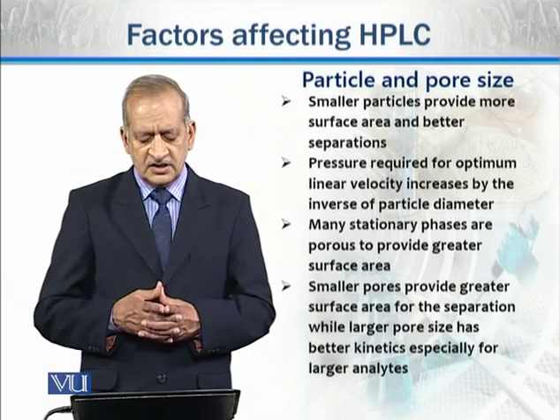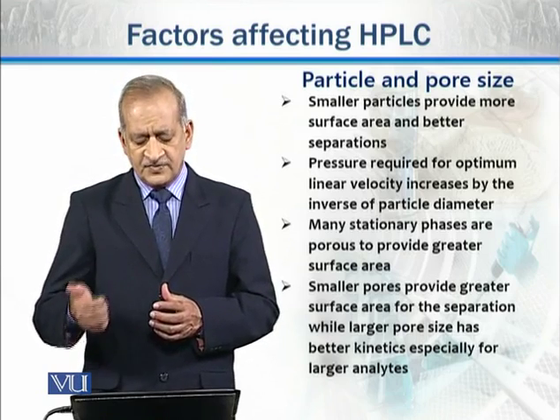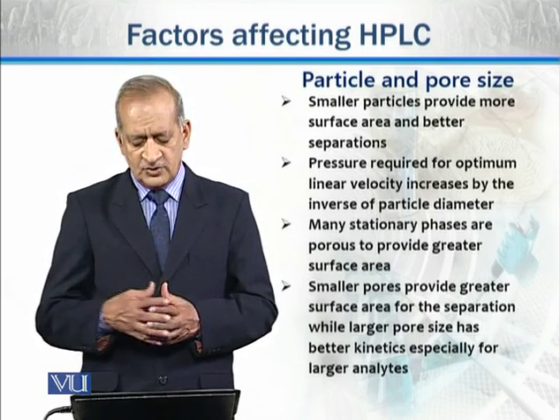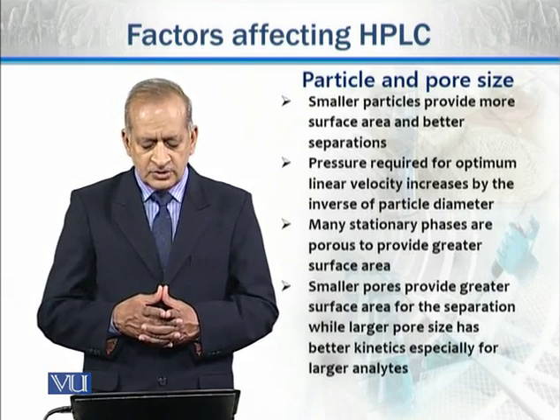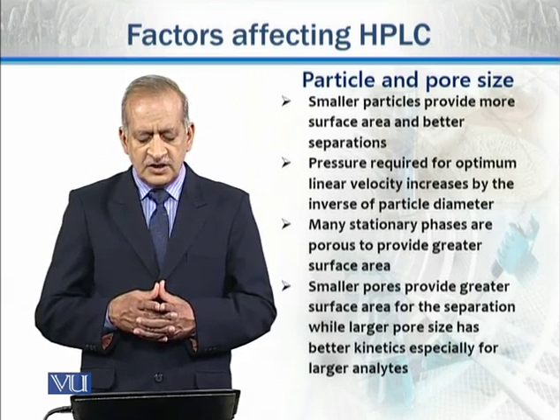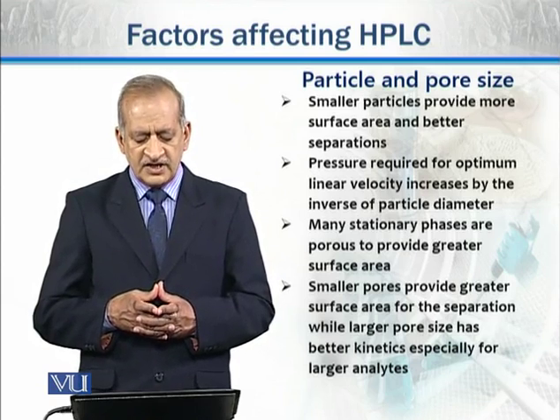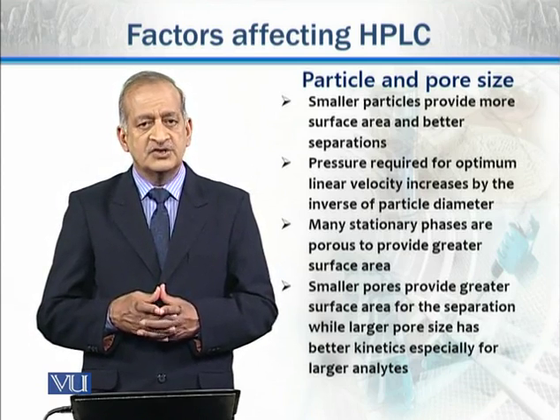जाहिर है अगर surface area ज़्यादा होगा तो उसके मुकाबले में हम कहेंगे separation जो है वो बेहतर तरह से होती है. Smaller pores provide greater surface area for the separation, while larger pore size has better kinetics, especially for larger analytes.